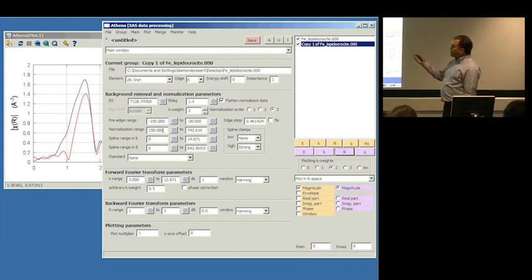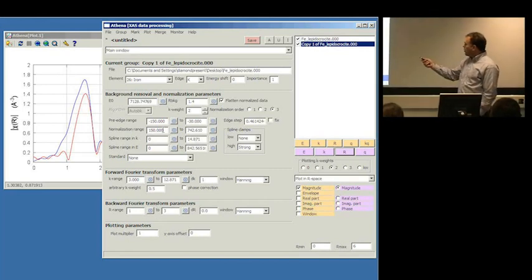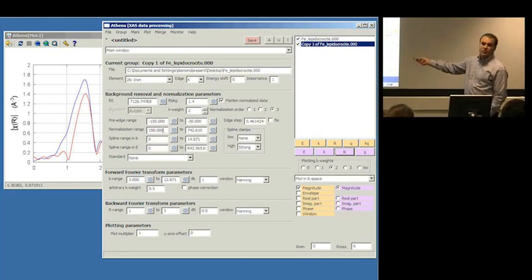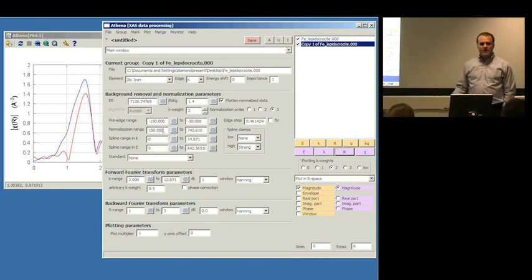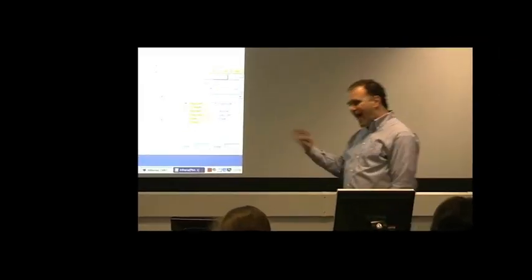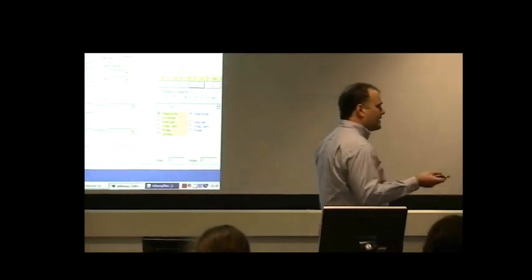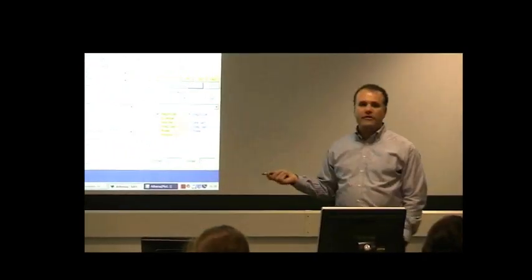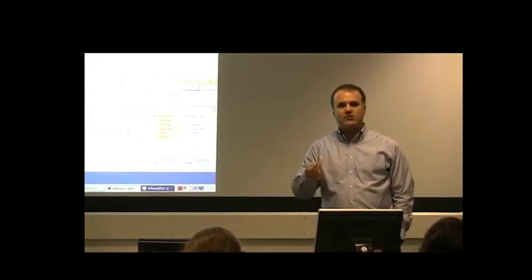But if we choose a more modest value of RBKG, something in the 0.8 to 1.2 range, where the Fourier components in this region weren't really changing very much, it was just the details down here, I think you'll find that as you change RBKG from 0.8 to 1.2, whatever values it is that you will extract from the data by analyzing this first peak won't much change. And that is the definition, ultimately, of a good background removal. Something that does a reasonable job of processing the data, but isn't too highly correlated with the numbers that you actually want to measure from your x-ray data.